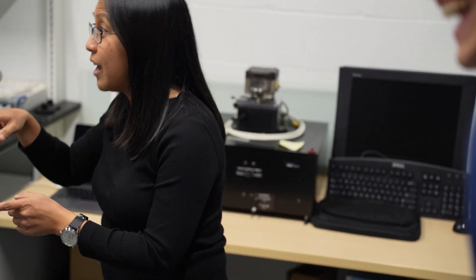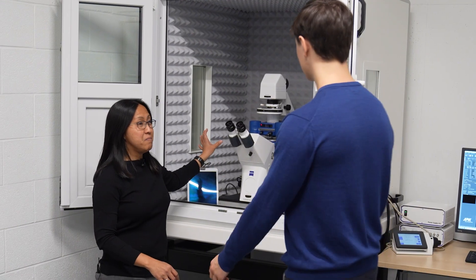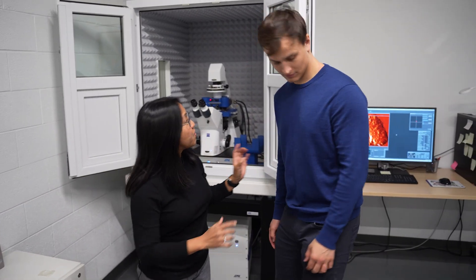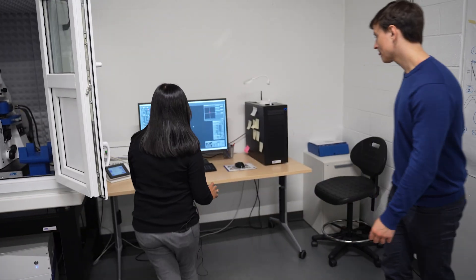Do you know what they say that seeing is believing? I believe feeling is seeing is believing. And AFM can do that fantastically. So here is the AFM, but here is where I would let you see all the cool stuff.